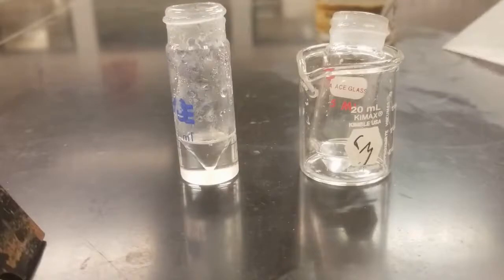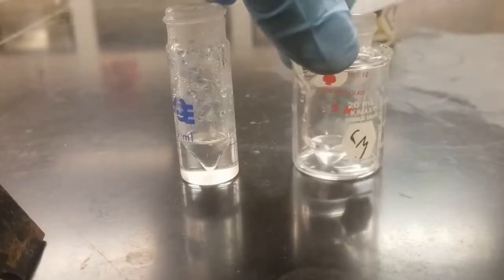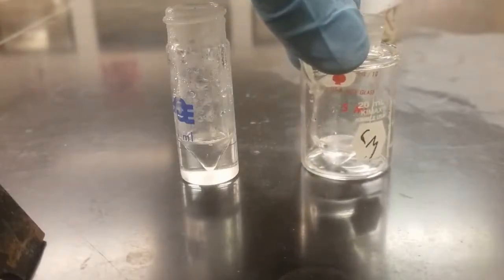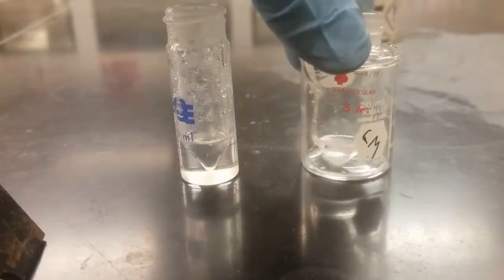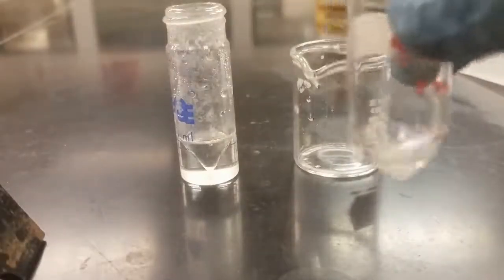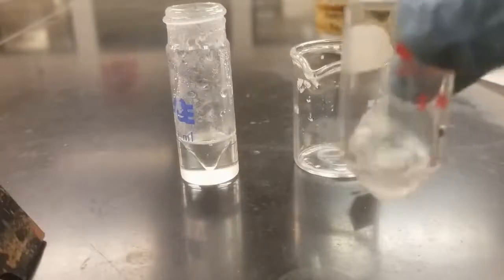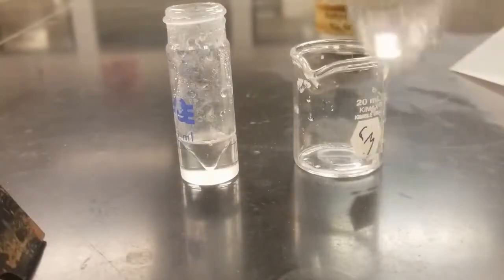And now we can go ahead and just sprinkle in our sodium sulfate. Give it a little swirl. And then we can wait for this to dry.